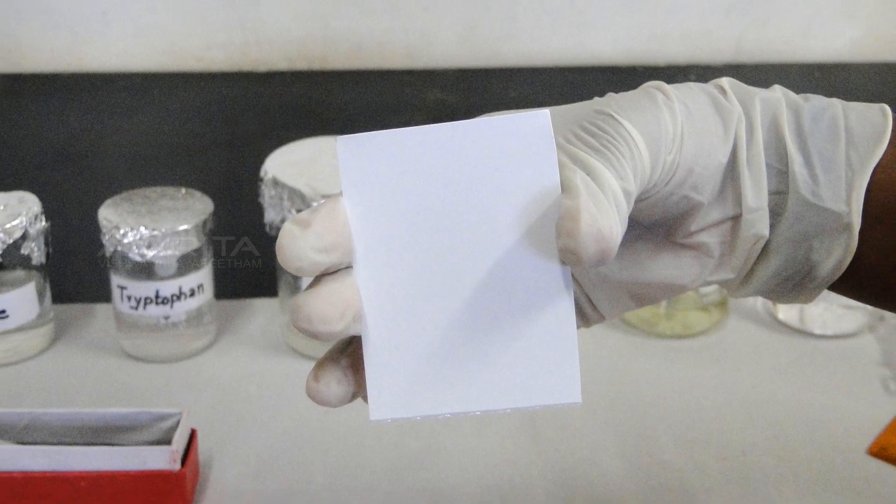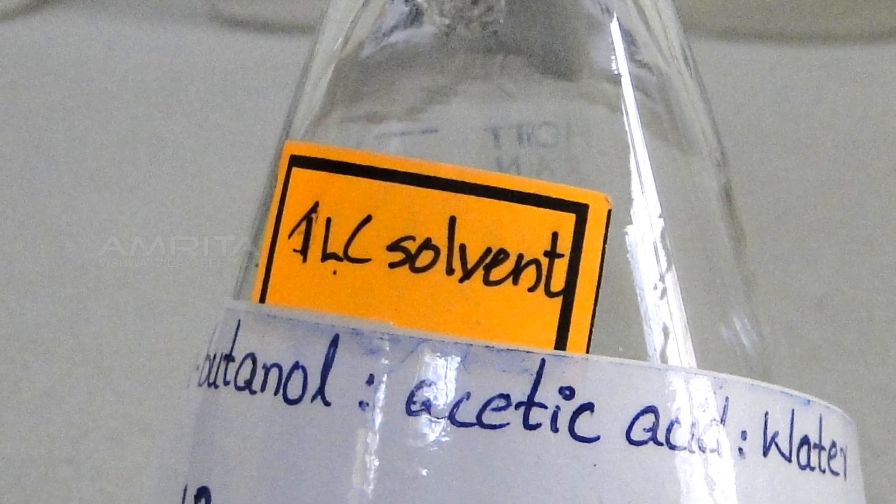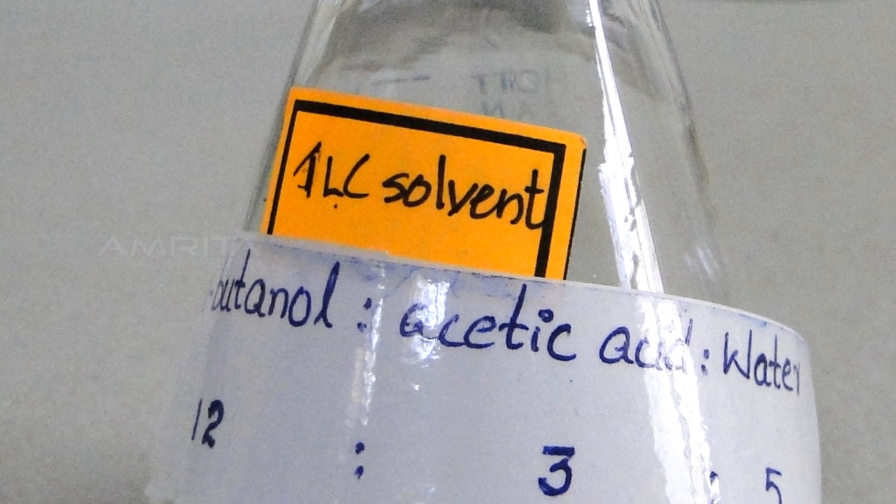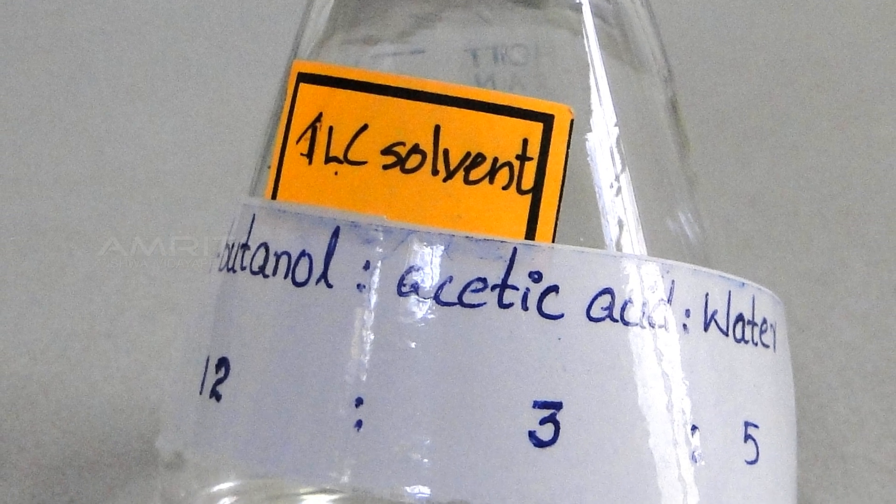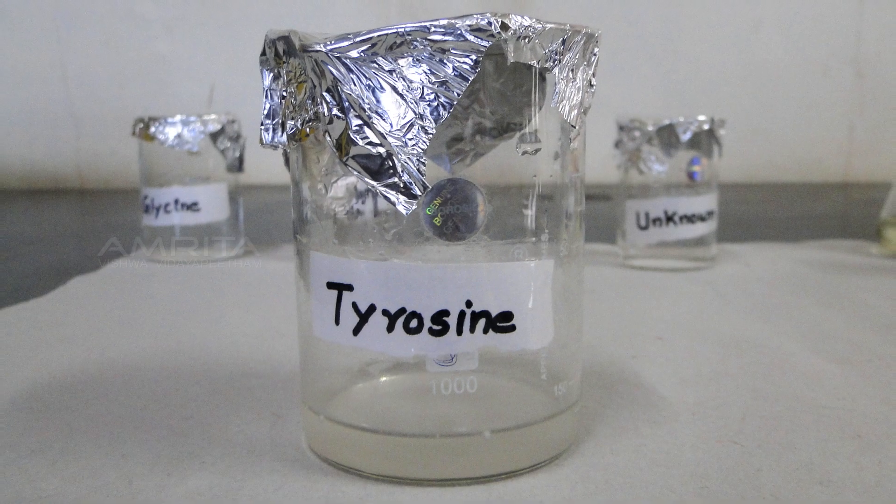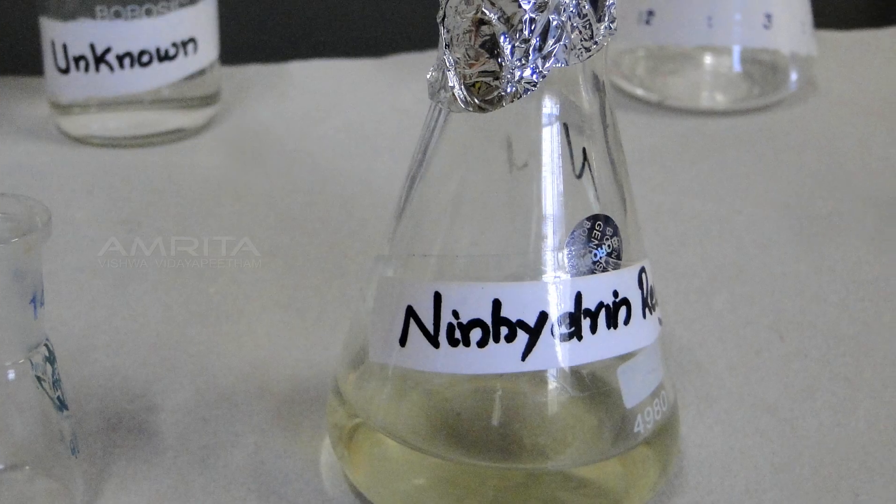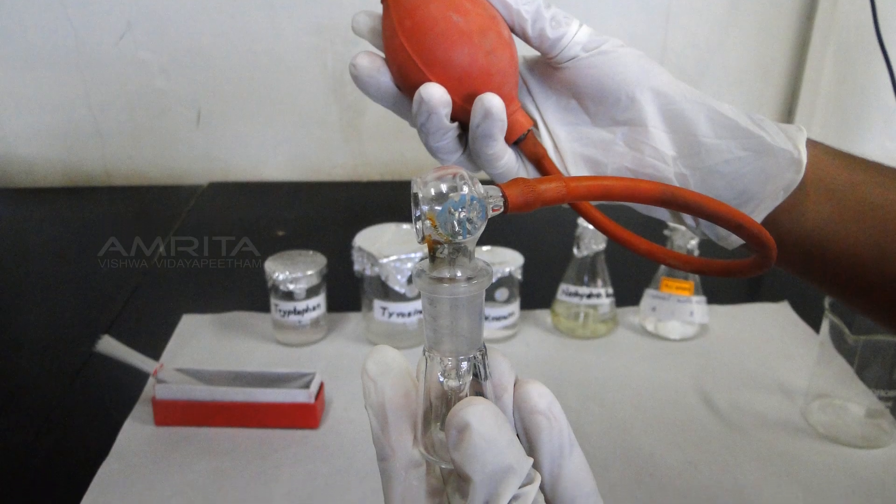Apparatus: TLC plate, solvent - a mixture of N-butanol, acetic acid, and distilled water in the ratio 12:3:5, three known amino acids, an unknown mixture of amino acids, ninhydrin, a spray bottle, and a blow dryer.